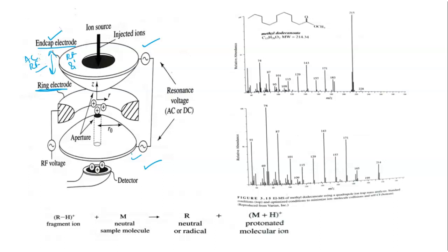In the ion trap, ions of all the mass by charge values are in the trap simultaneously. That means all the ions having different mass by charge ratios are trapped simultaneously, and they oscillate in concentric trajectories. OK, that is one thing. So do you understand what is happening here exactly? In the ion trap, all of the ions are actually trapped simultaneously.